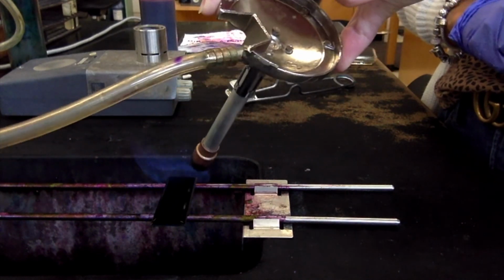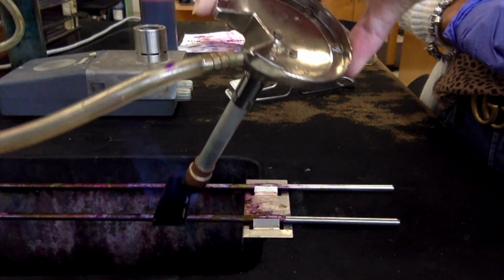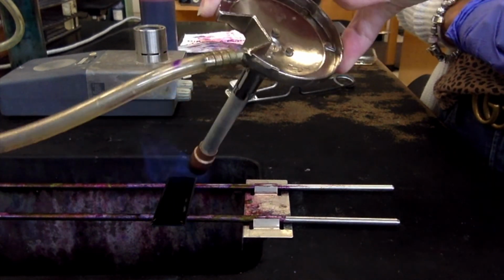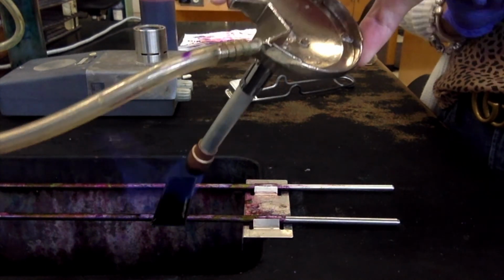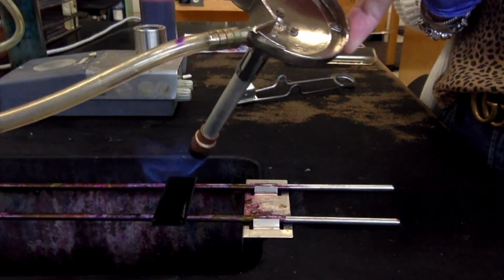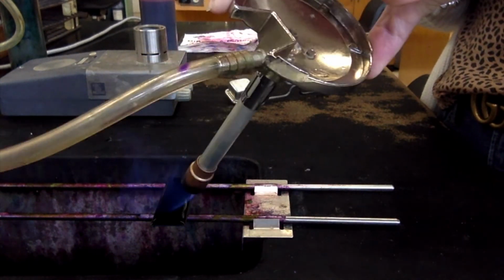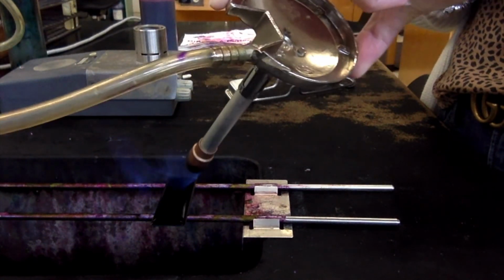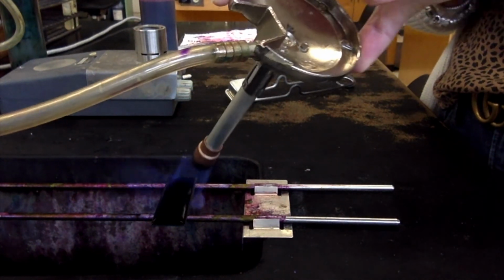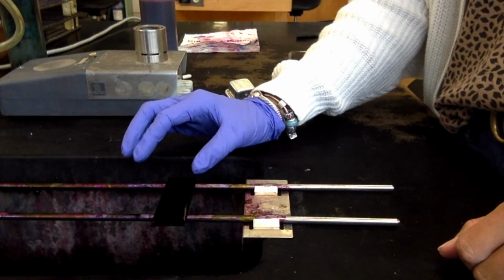Now I want this to steam for 5 straight minutes. After the 5 minutes, I'm going to let it cool for 2 because it's really, really hot before I move on to the next step. And again, this step is the mordant, okay? The fire is the mordant in the spore stain. And after I heat this for 5 minutes, we will move on to the next step, which is going to be the decolorizing step.